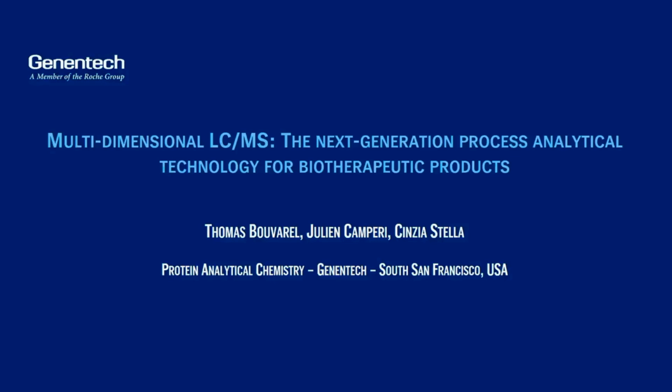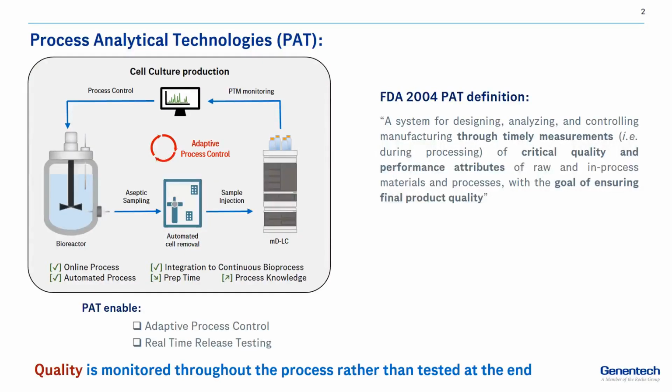Hello everybody. It's my great pleasure to be here today to share with you the work that was done in my group over the past couple of years to develop multidimensional LC workflow for the next generation of process analytical technology for biotherapeutic products. But before diving into this technology with you, I wanted to go back on what's a process analytical technology, also called PAT.